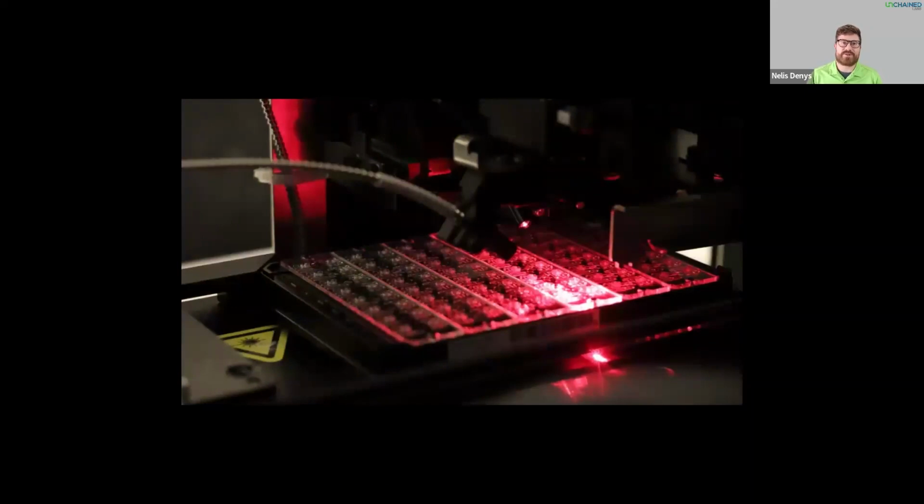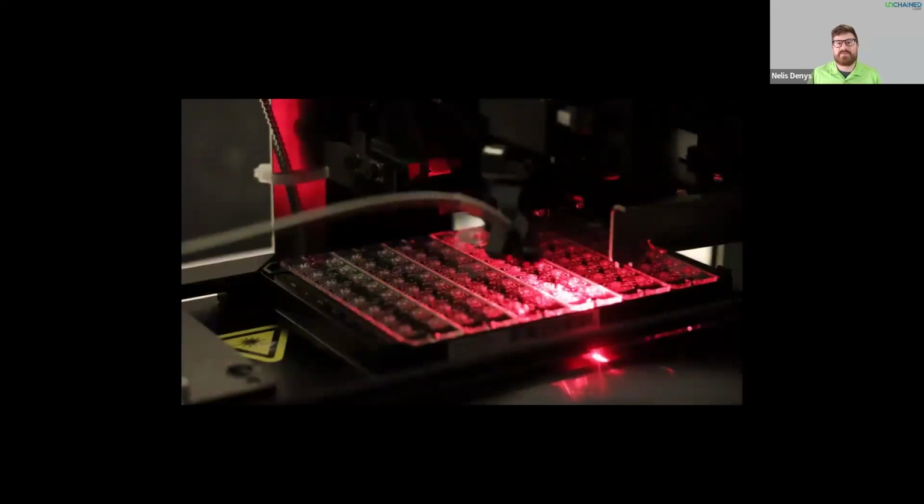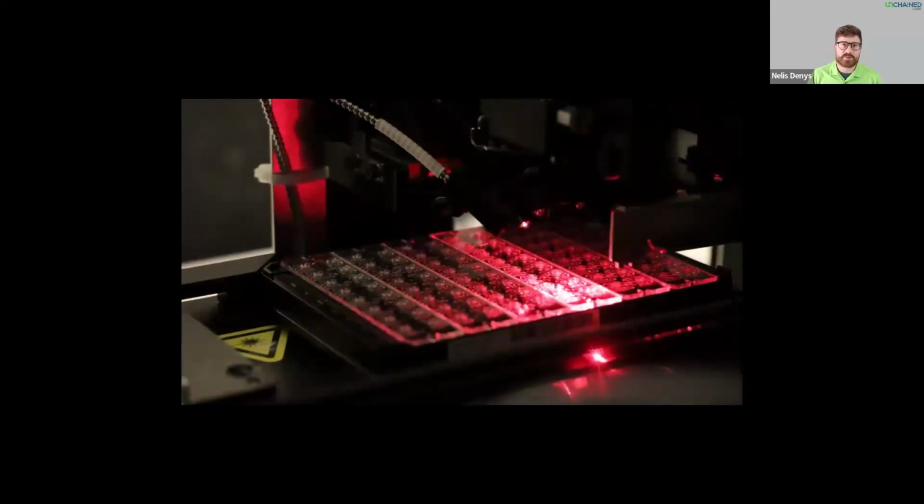Now, protein aggregates can be large and make your sample multimodal, and this will result in anisotropic light scattering, meaning your scattering is not the same in all directions. So you'll get different scattering results depending on the angle an instrument is looking at or measuring at. Tiny bits of aggregates might not be visible yet with single angle backscatter DLS, but they would show up on forward scattering.